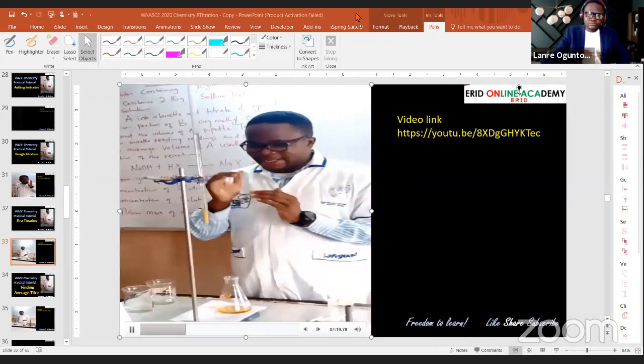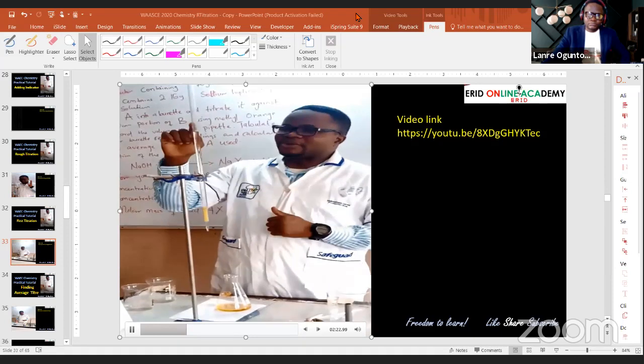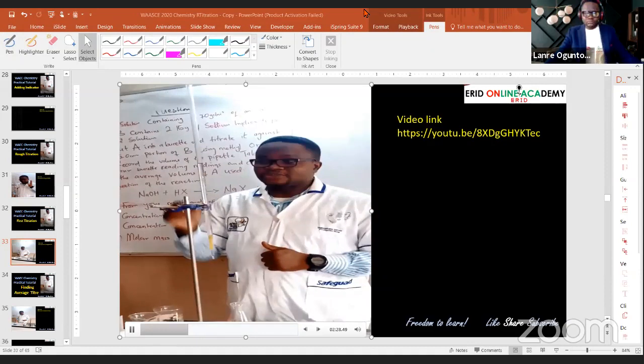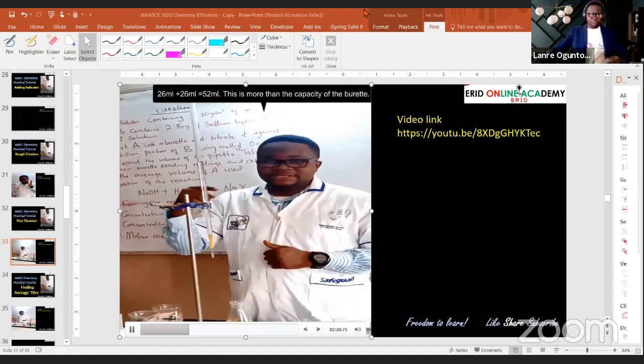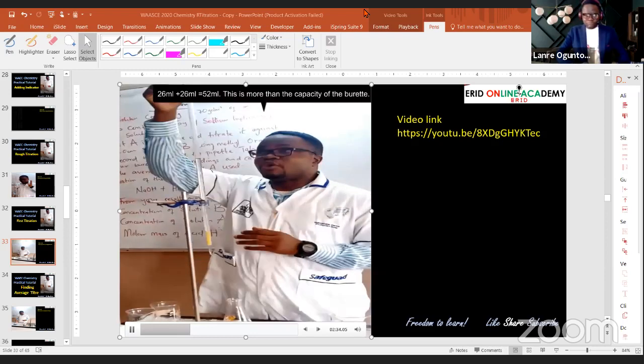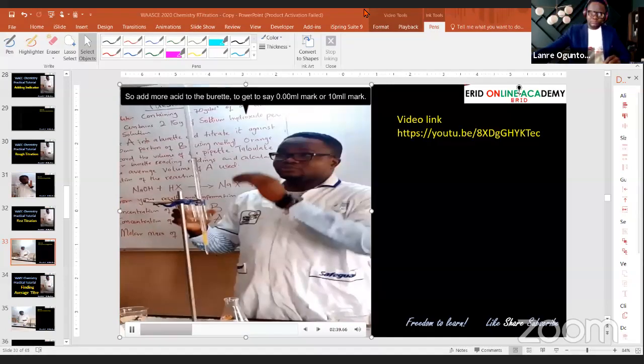Okay, so that is a guide. Now, if I did the first one, I got 26, and the maximum value of my burette is 50. It means that to get another 26, 26 plus 26 will be 52, which is more than this value. So therefore, I need to add more what? More acid to my burette.